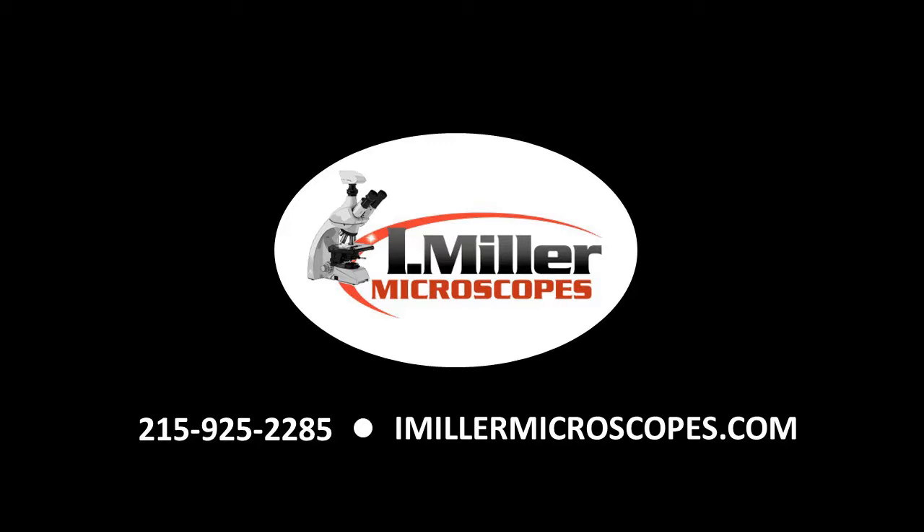These are ten great reasons why you should buy the Leica DM750 microscope. If you have any questions, please give us a call at 215-925-2285 or visit us online at imillermicroscopes.com.